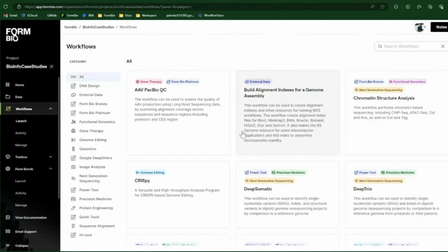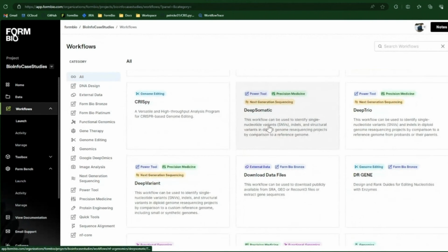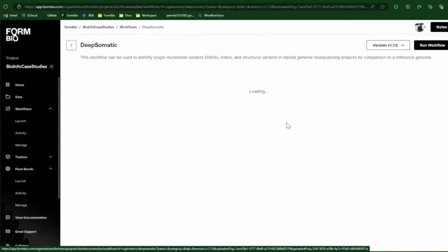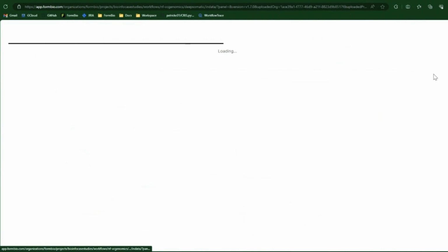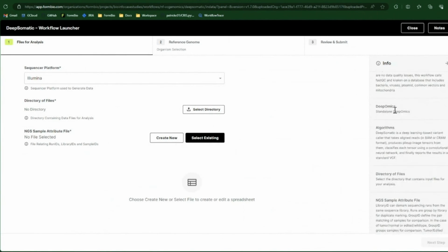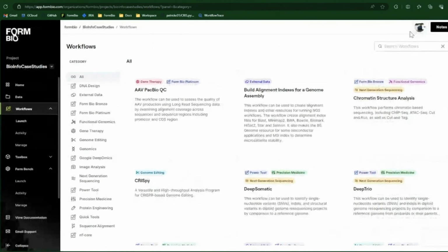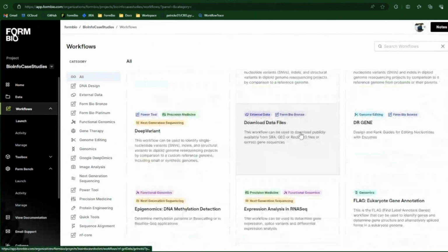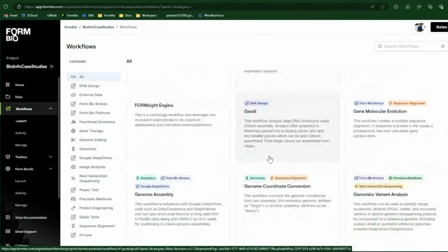All of the inputs will function the same way, and they will all have some help text to go along with them, whether in the overview docs or on the right side of the workflow launch tabs. There will be help text to go along with each of them to walk you through the different steps, to keep familiarity with being able to use the tools.